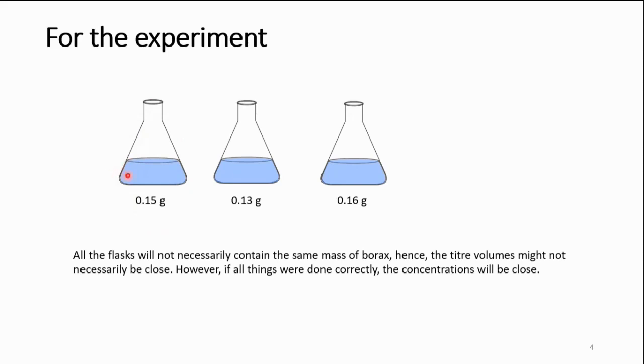Then you go to the next beaker, and you shake out again, and go back and reweigh the 100 ml beaker and its contents, and then you get the last amount out into this conical flask. Now, even after removing the last amount, you still have to weigh the beaker and its contents to know exactly what is going on, how much is in each of your conical flasks.